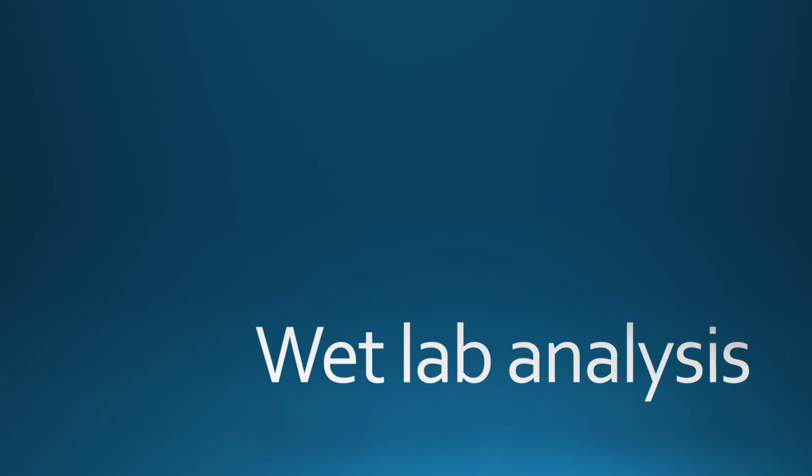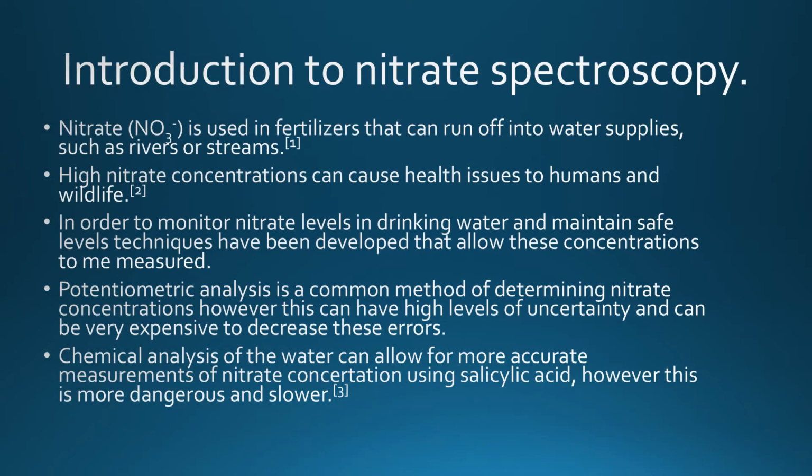So in the beginning I was assigned nitrate spectroscopy for my method and introduction. However, I have elected to analyze unknown solution A as I thought it had the most relevant and useful data to analyze. To kick things off, we're going to go over why it's important to measure and maintain nitrate levels in the soil and in water supplies.